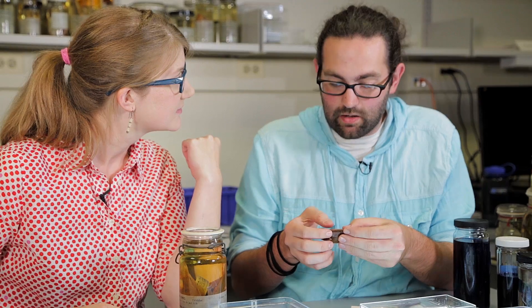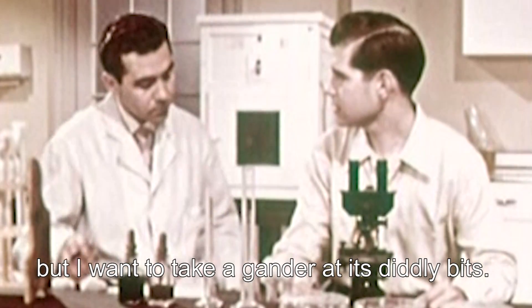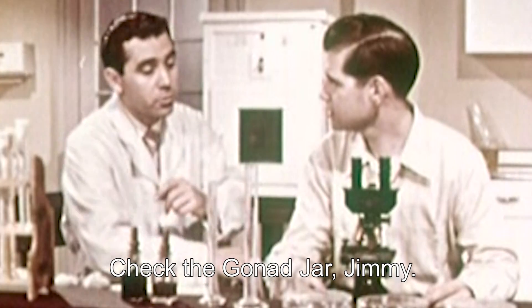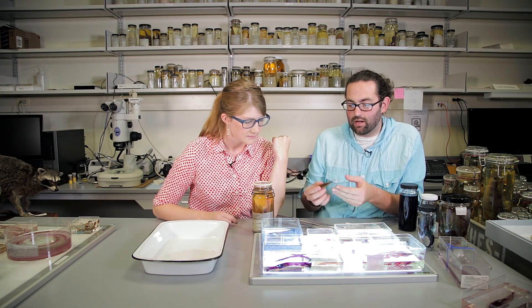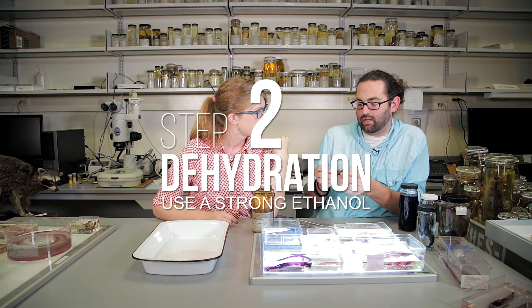We take the gonads out and store those in a vial back in the jar, so that if later someone wants to look at sections of the reproductive tract, they can still go back and do that. Then we're left with our fish, and we first dehydrate them in really strong ethanol — like 95% ethanol — and then we start the process.